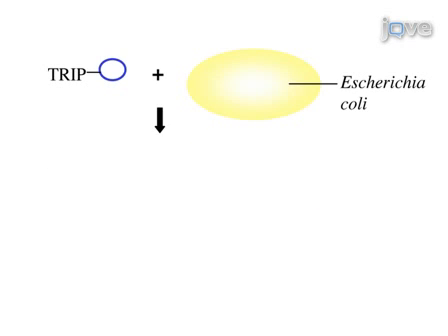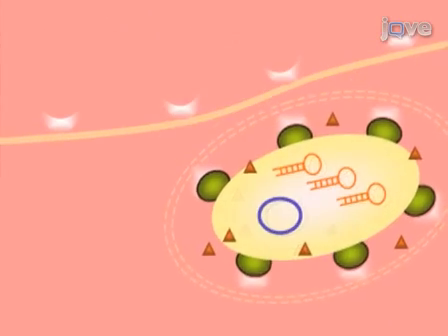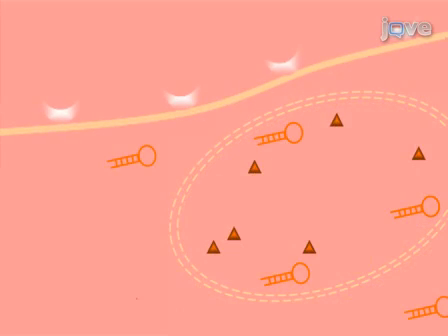TRIP constructs are introduced into a competent non-pathogenic Escherichia coli strain, which encodes T7 RNA polymerase necessary for the T7 promoter-driven synthesis of shRNAs. The bacteria and eukaryotic cells are co-incubated, allowing the bacteria to enter the eukaryotic cells. The shRNAs are released and enter an RNAi pathway.